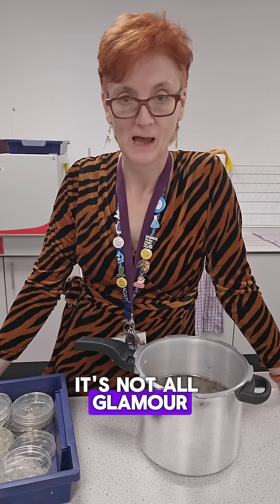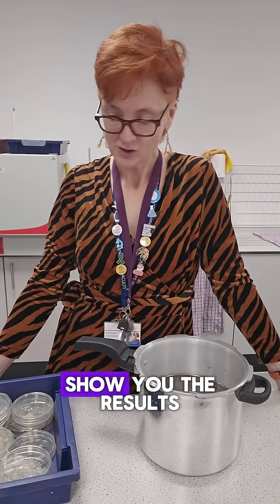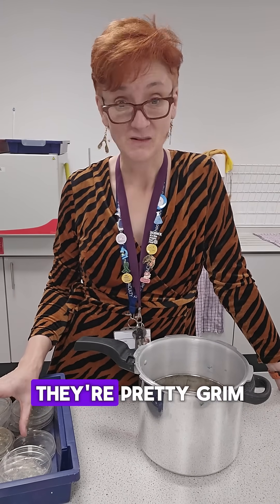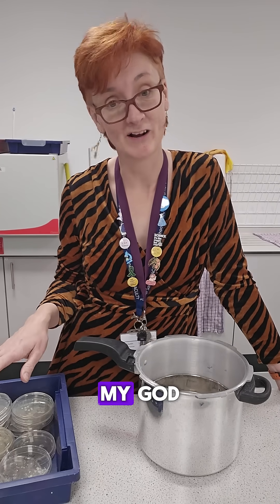School science technician — it's not all glamour, she says wearing a velvet dress. After yesterday's microbiology video, I thought I would show you the results of the practical. They're pretty grim. And you're very lucky that this isn't smell-o-vision, because my god.